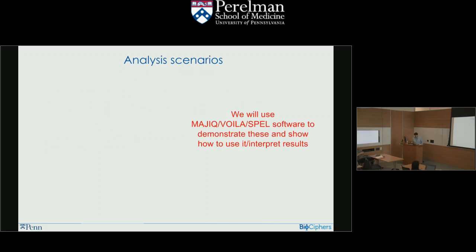So what kind of analysis scenarios might we want to accomplish? Yosef mentioned before, a common thing you want to do is analyze psi. What are the relative inclusion levels of different isoforms within an experimental condition, or delta psi if you want to compare between two experimental conditions? How large is your data set? How many samples do you have in groups? How many groups do you have is something that we'll consider. Do you have replicates or not? We can handle analysis with and without replicates.